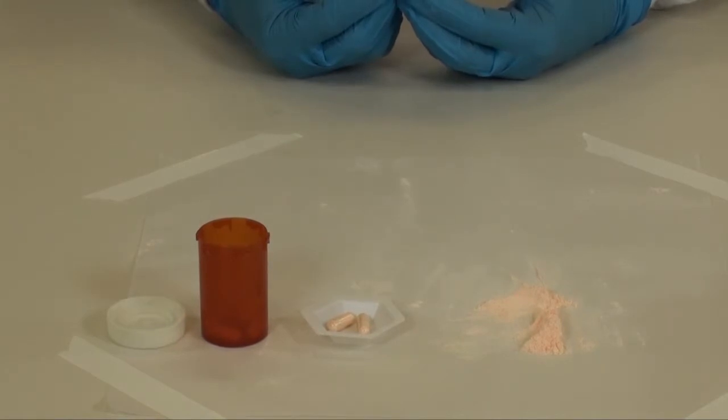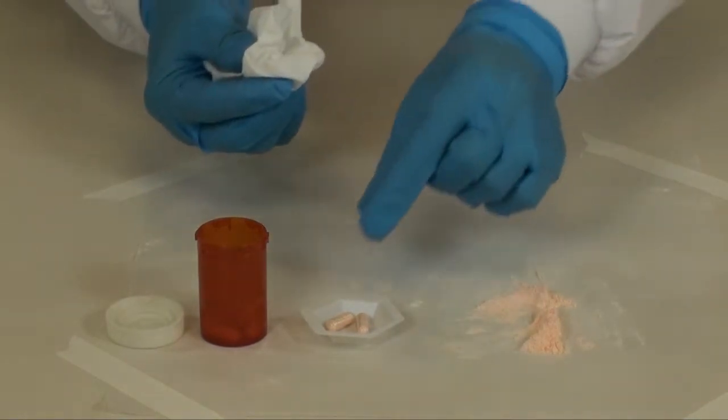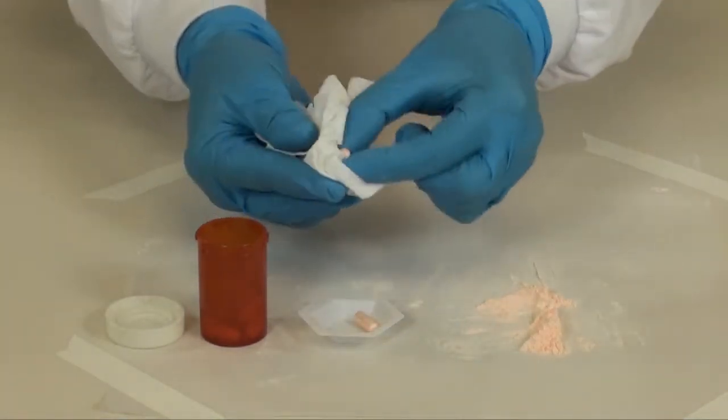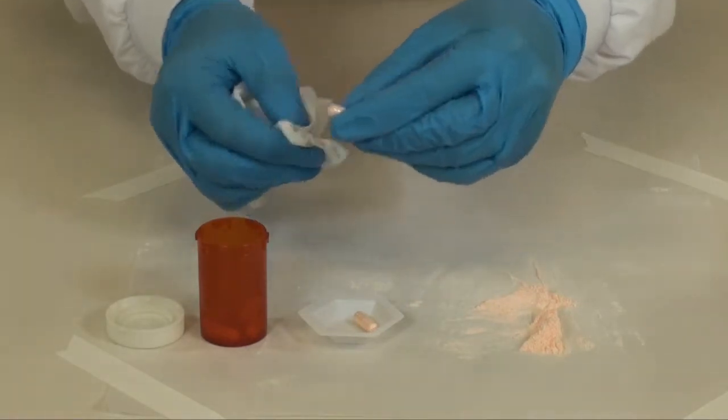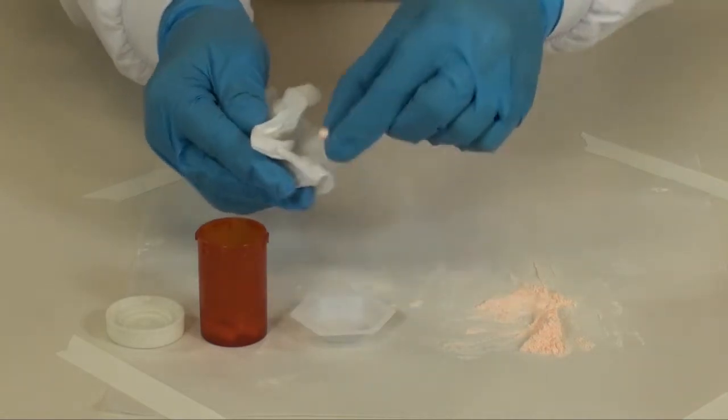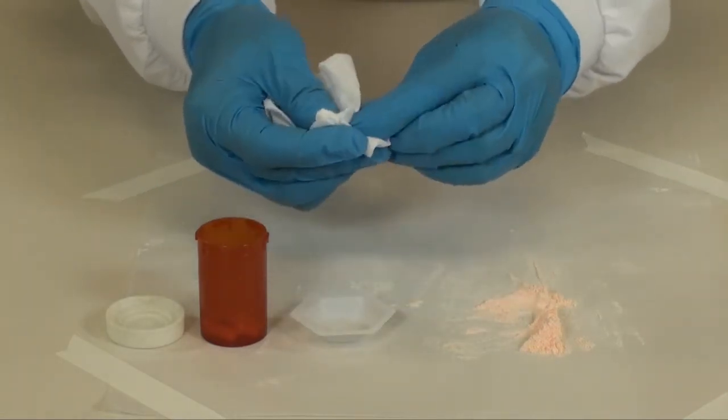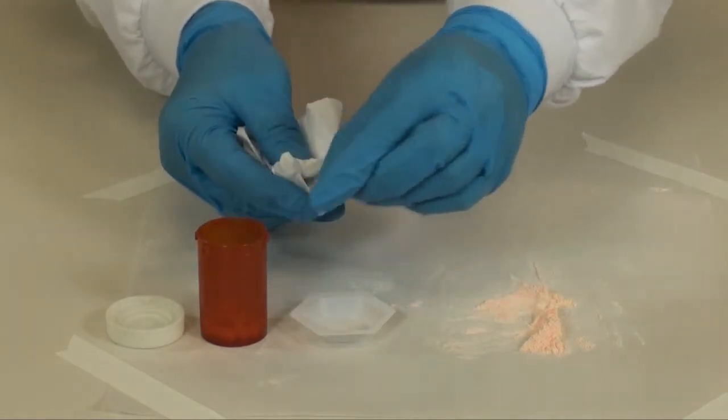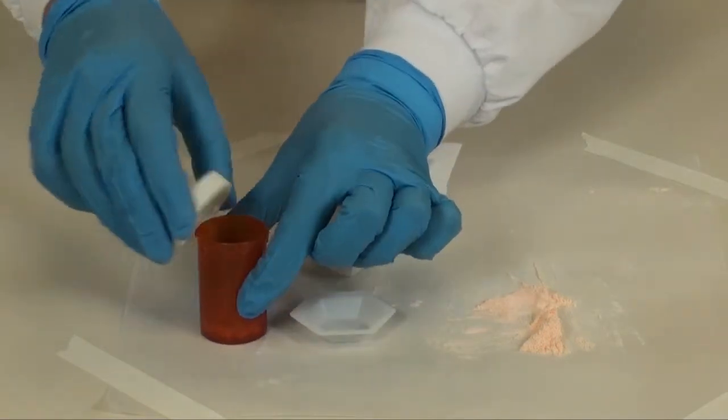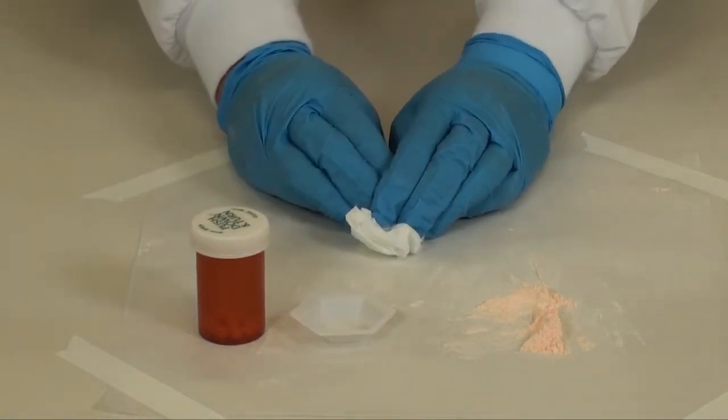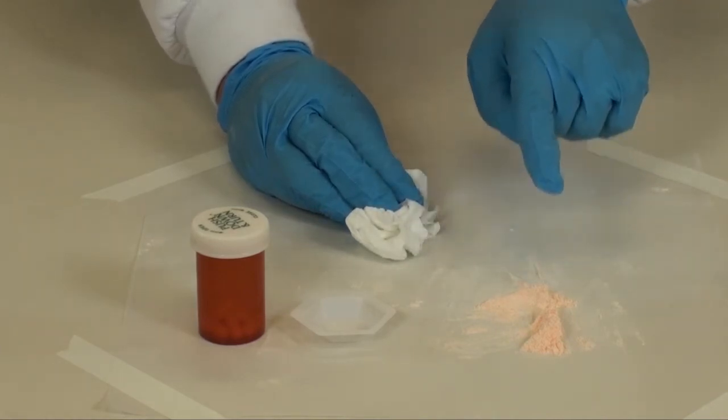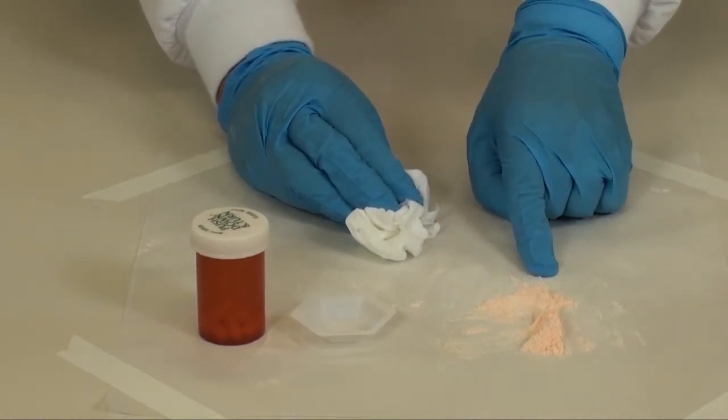You will need to polish your capsules prior to dispensing. Take a soft cloth, Kleenex, or chem wipe, and remove the excess powder from the capsules to shine them. Go ahead and cap your prescription bottle. It is now ready for dispensing. Remember to dispose of your excess powder appropriately.